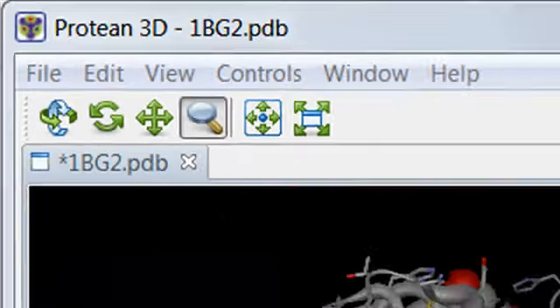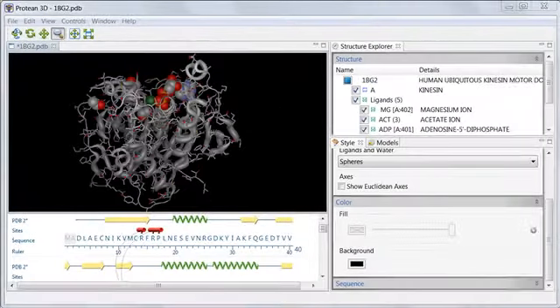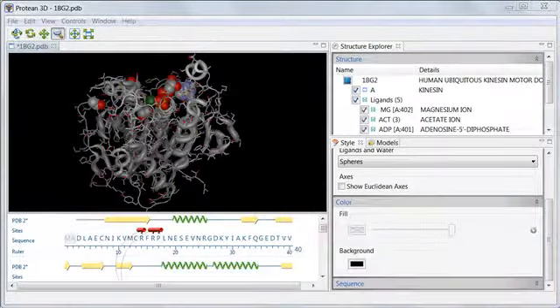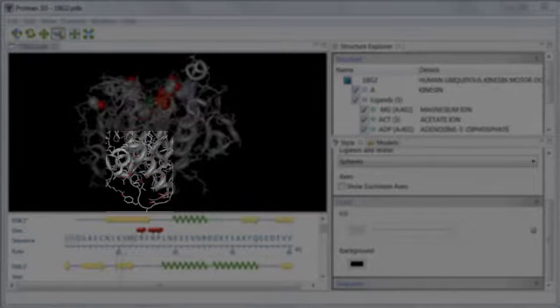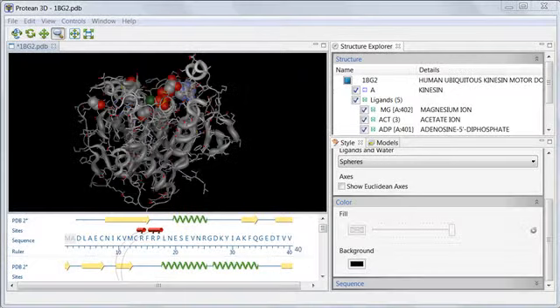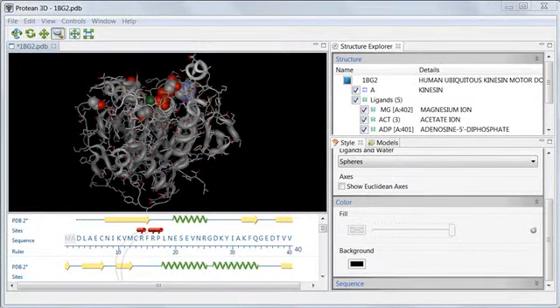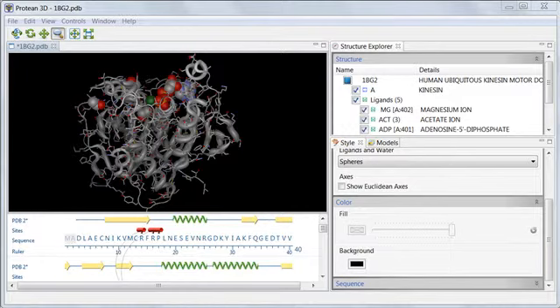I'm going to highlight the locations of two features of interest, the ADP molecule and the relay helix. I'll do this by changing the rendering styles of the whole structure, then coloring each component of interest.